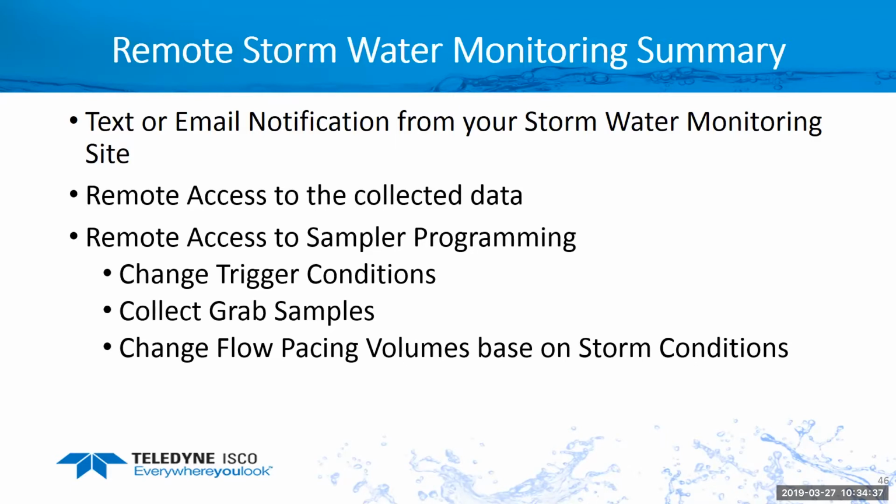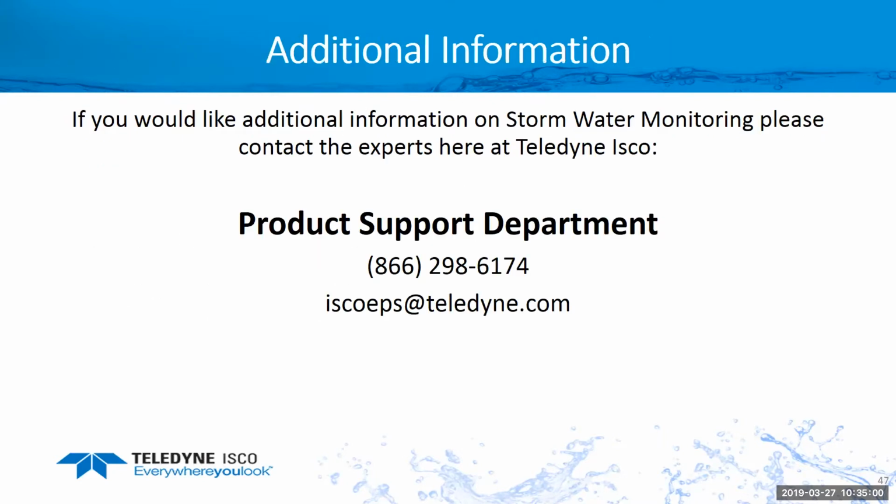And we can contact that information remotely, download the data, look at it on the web, look at our desktop, et cetera. That goes the whole full circle of how we get the data out in the field, how we get it deployed, how we can gather the data, and how we can analyze it to know when we have to go back out and get the information, as far as grab the bottles, take them to the lab, et cetera. That pretty much concludes my presentation.